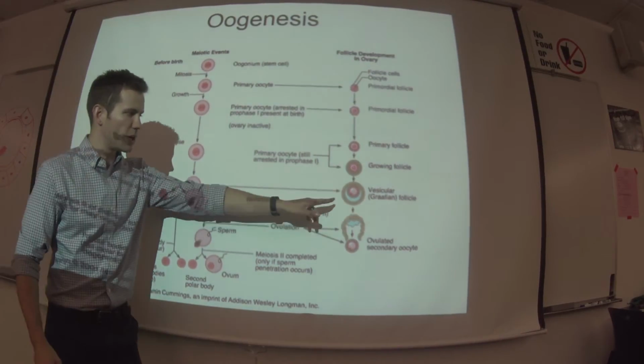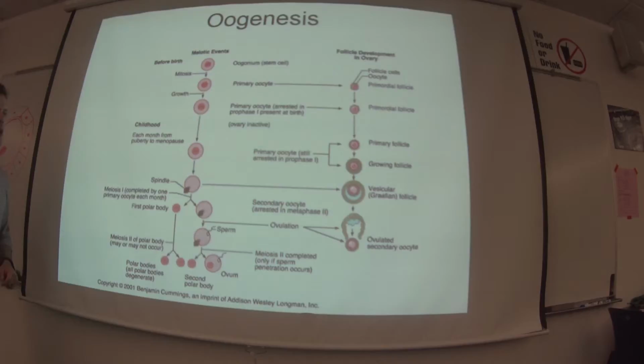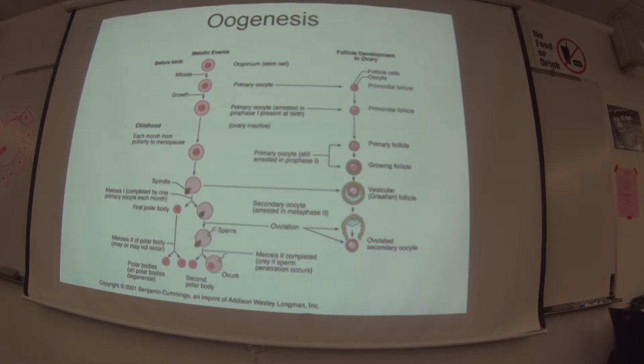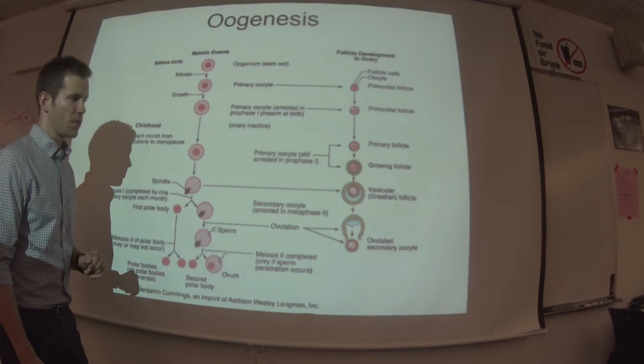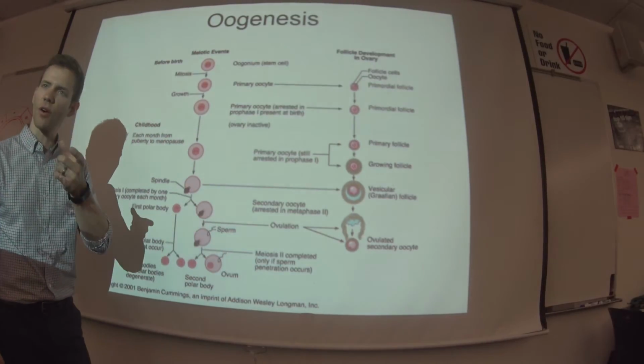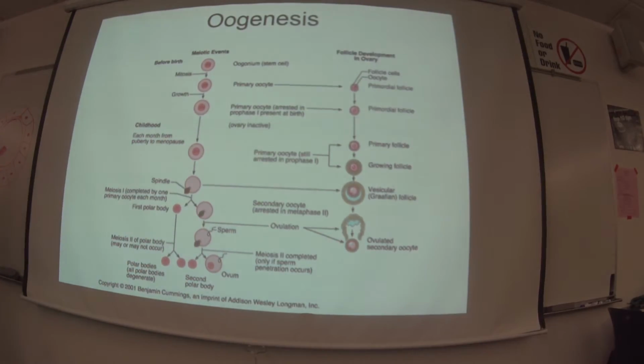That's actually a pretty big crack in this illustration. But the minute that little teeny crack shows up around the oocyte, we call it a secondary follicle. We're going to look at an example of this because that's probably the hardest one. I'm going to pull up a picture in a moment where we pick that up.